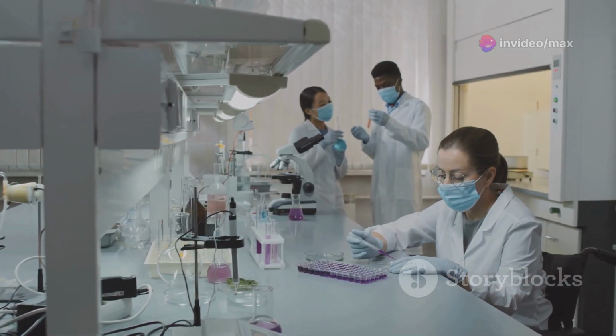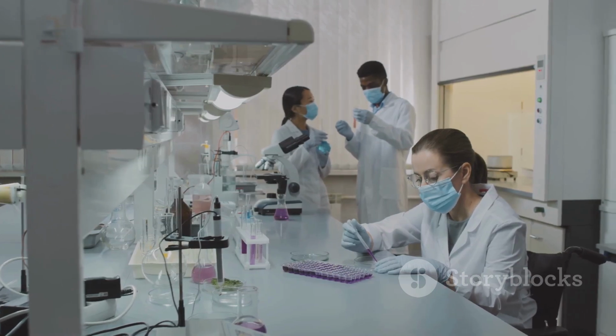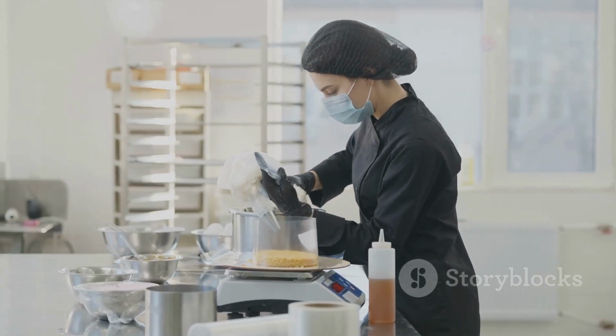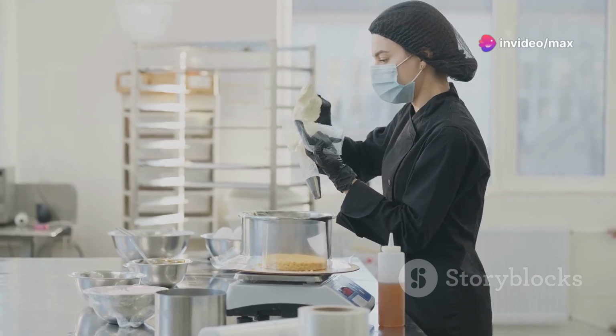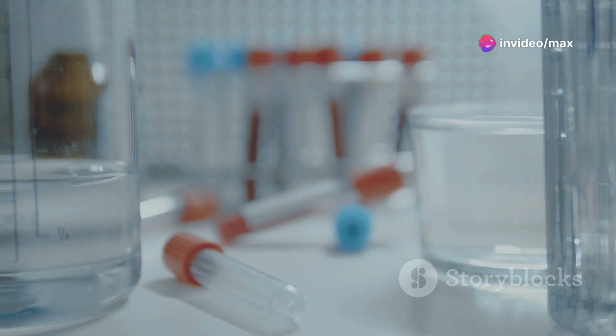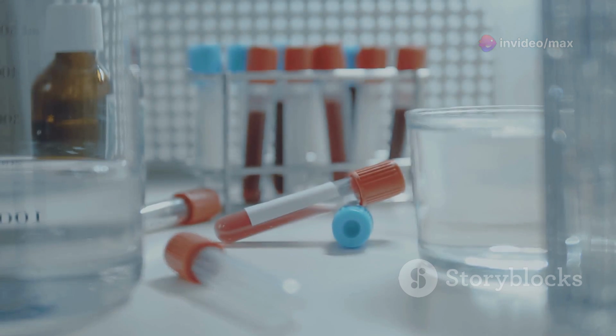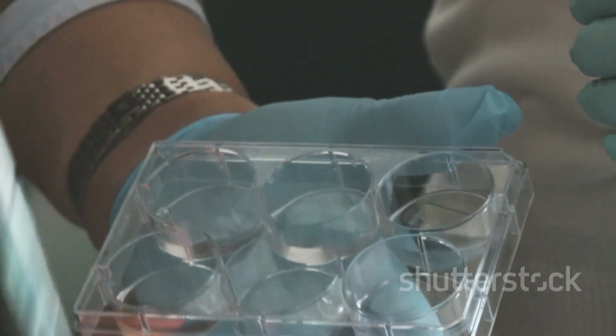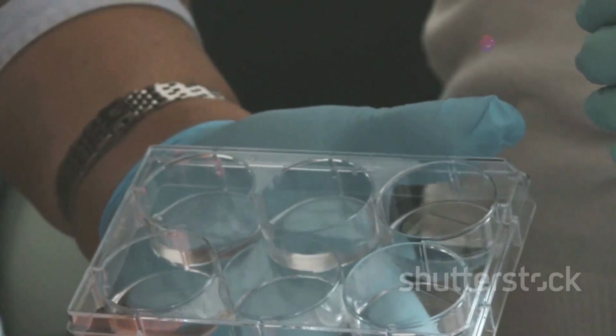To perform an ELISA experiment, we need a few key ingredients. Think of it like baking a cake. You need the right ingredients in the right amounts to create something delicious. First, we need our sample. This could be anything from blood serum to a food extract, depending on what we're testing for. Next, we need our trusty antibody, specifically designed to recognize our target molecule.